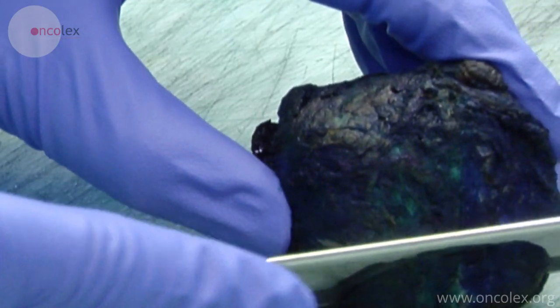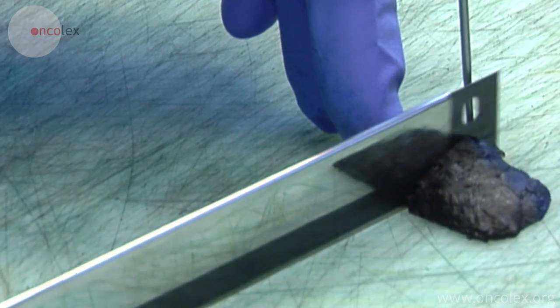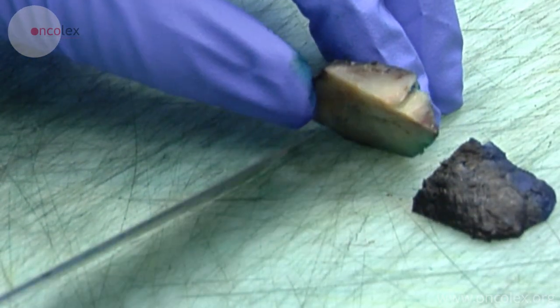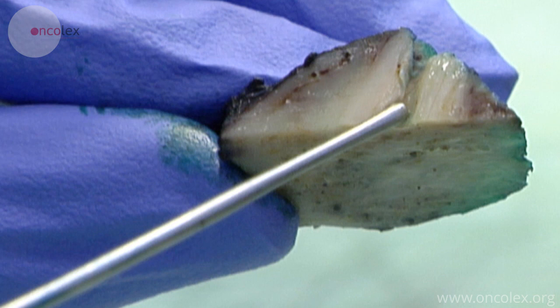A small slice is cut from the apex and the apex is divided through the urethra along the probe. The pathologist checks that the urethral mucosa is cut in half and included in the entire slice.